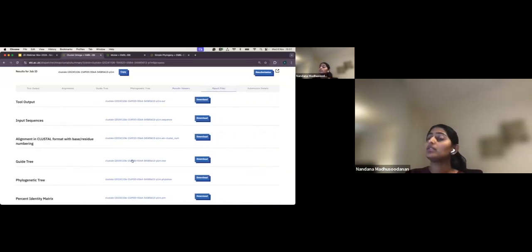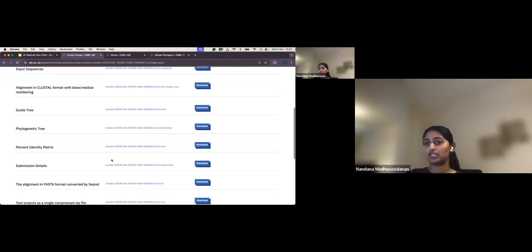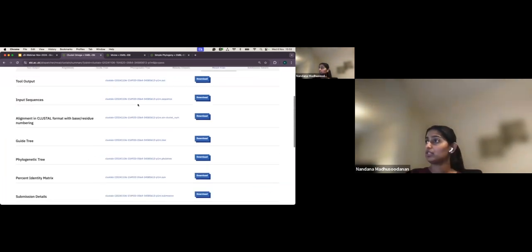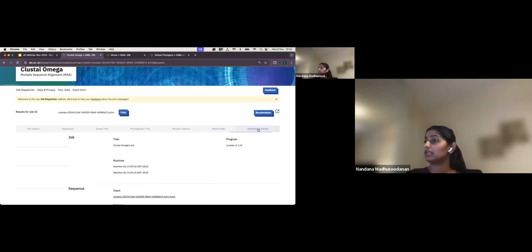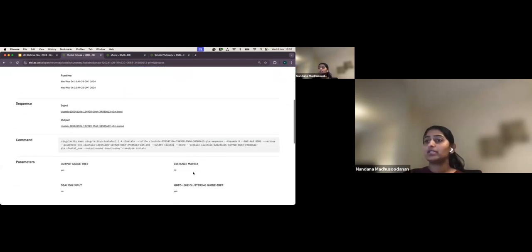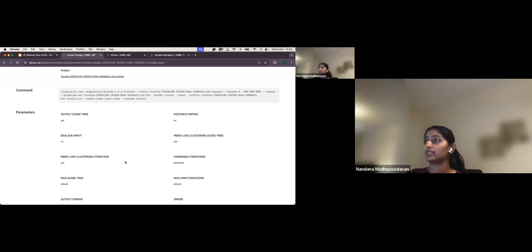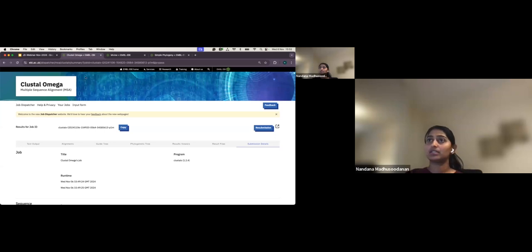All result files produced by Clustal Omega are available under the 'Result Files' tab: the phylogenetic tree, guide tree, actual alignment, percentage identity matrix, and more. A ZIP download option is available for bulk download. The 'Submission Details' tab shows the tool version, when the job ran, which parameters were used, and the actual commands executed.